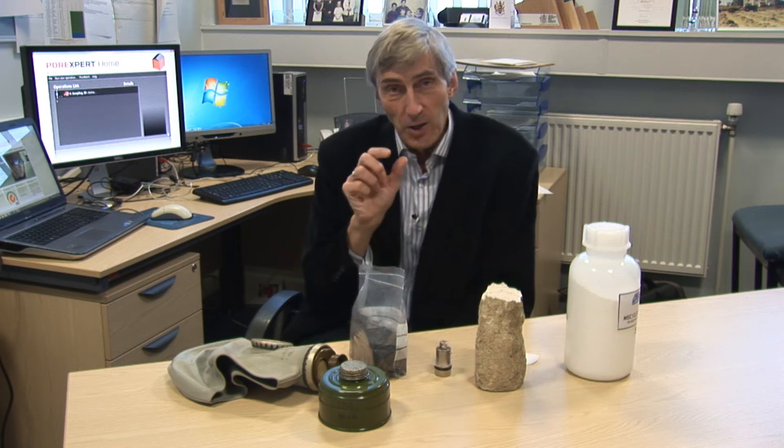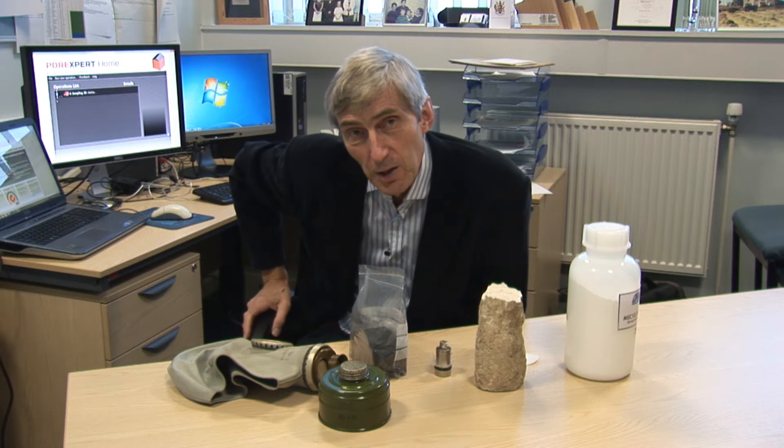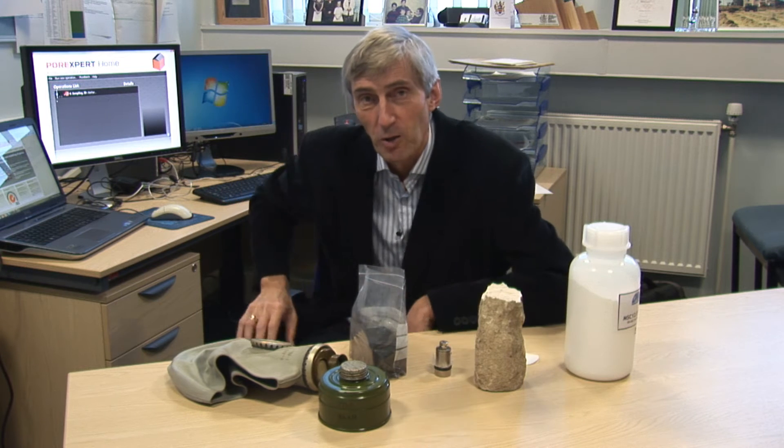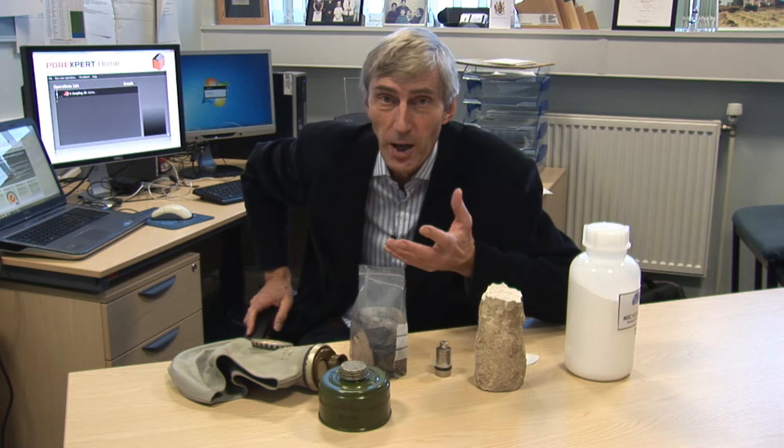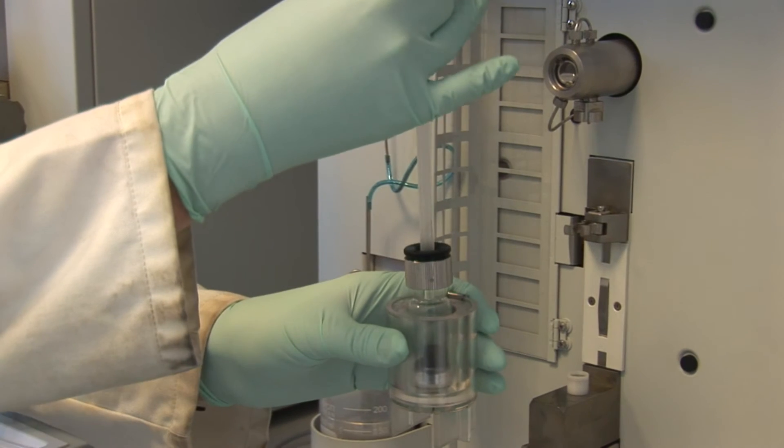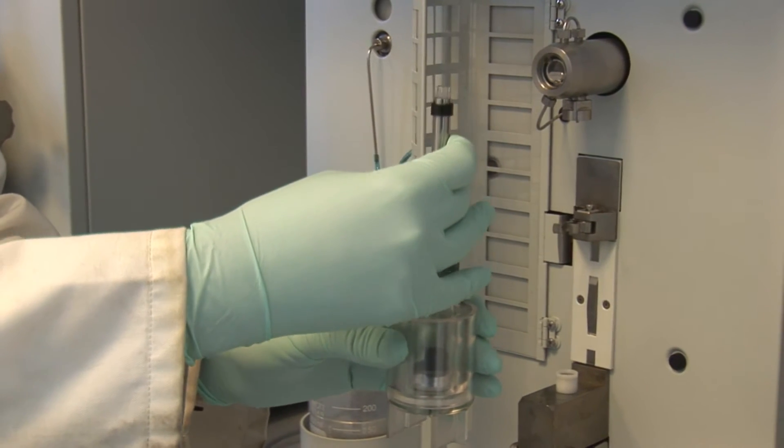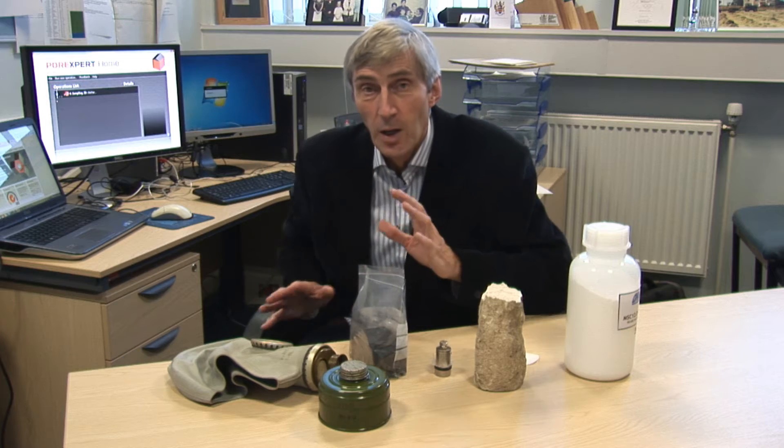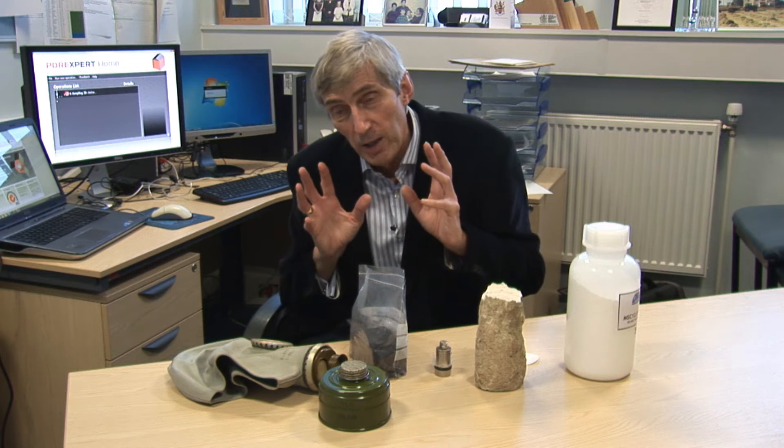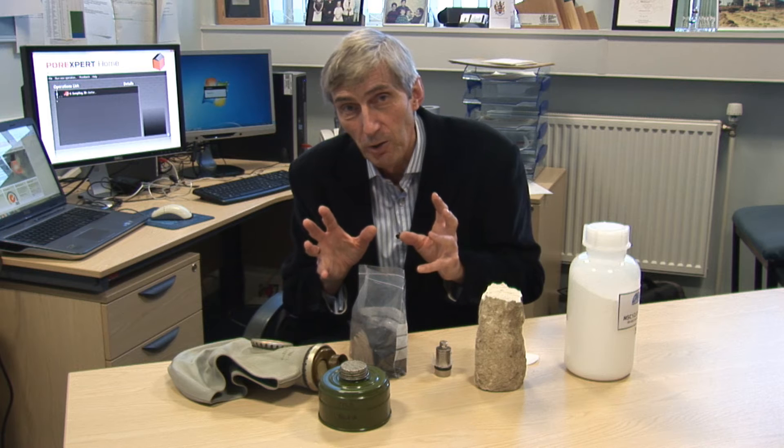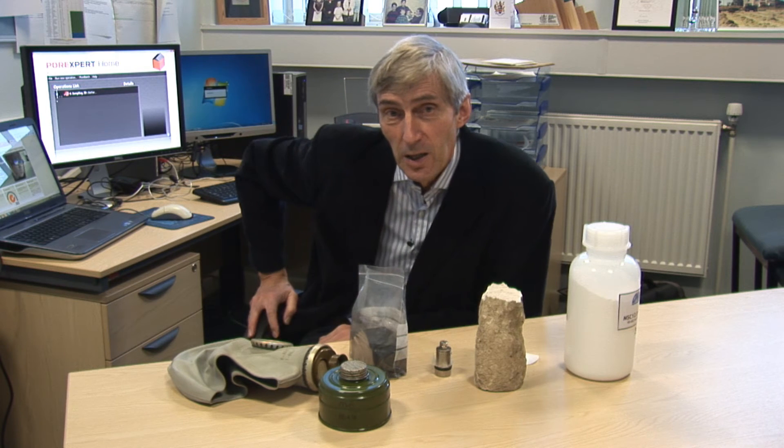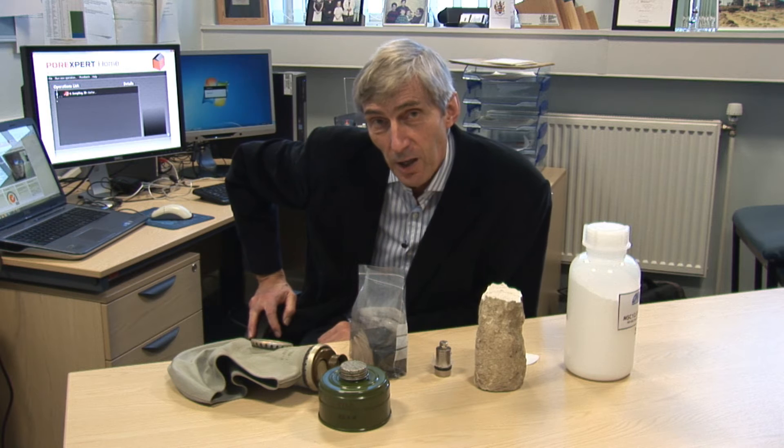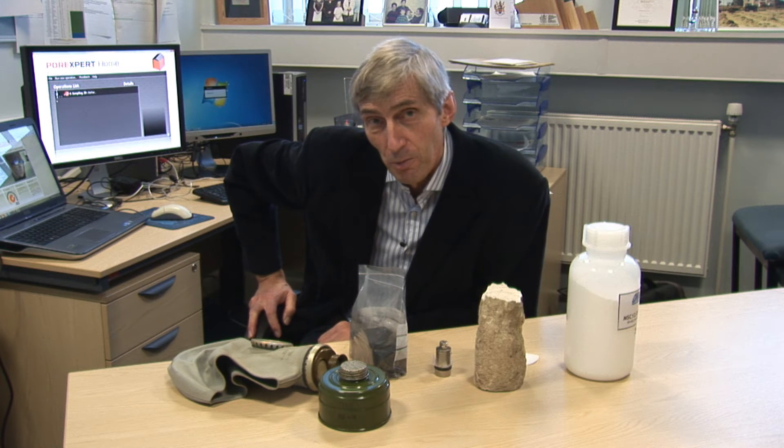And so PoreXpert is the software to help you do that. Now you may think that you already have a lot of information about your porous material. You may have X-ray CT scans, mercury porosimetry, you may have porometry curves, electron micrographs and so on. But all of those give you partial information about the porous material. And PoreXpert is the new software to bring all that together and help you solve your problems about porous material.